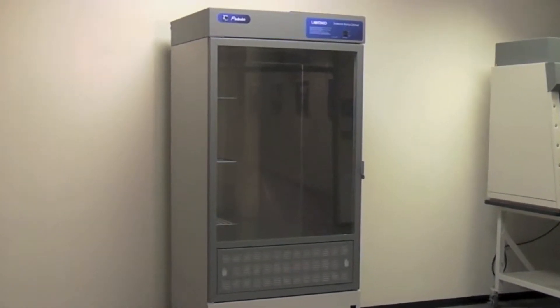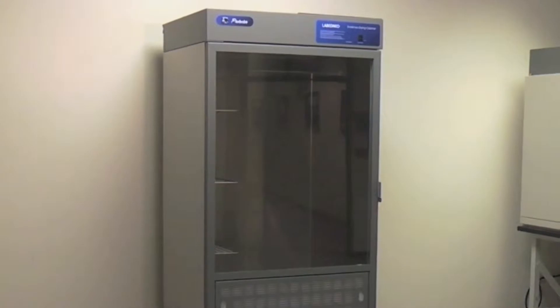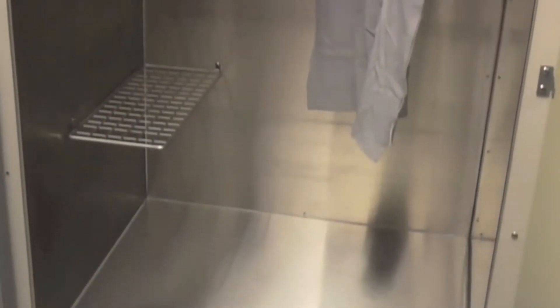LabConco's Protector Evidence Drying Cabinets are carbon and HEPA filtered ductless enclosures designed to safely dry wet evidence while maintaining chain of custody.